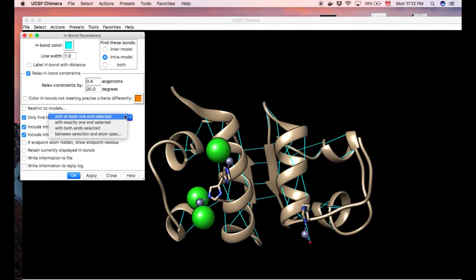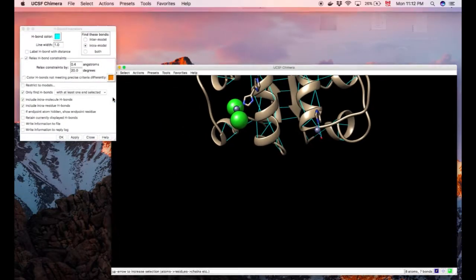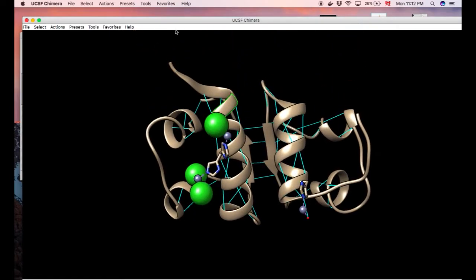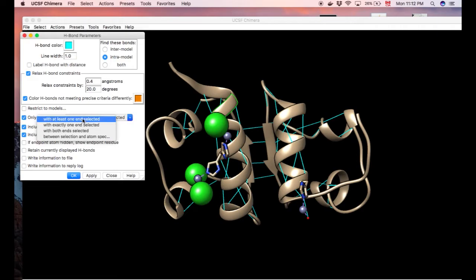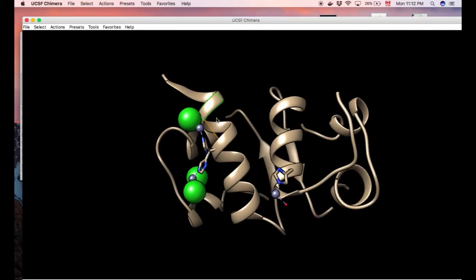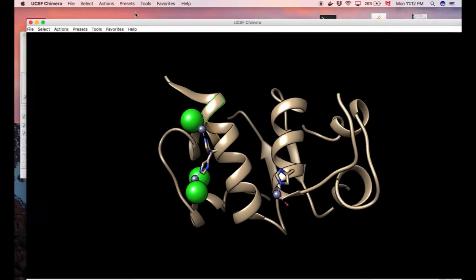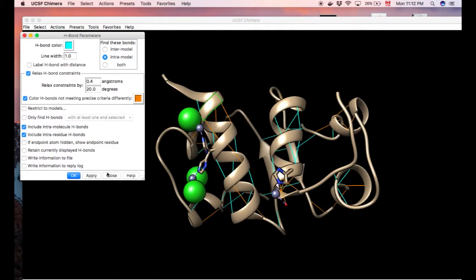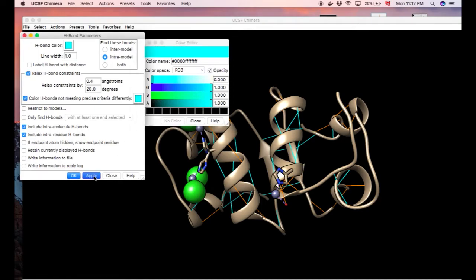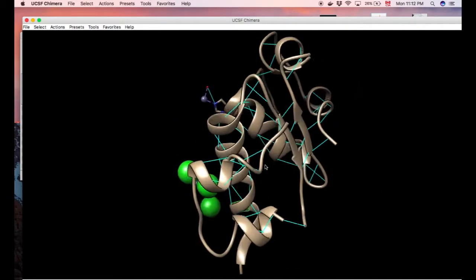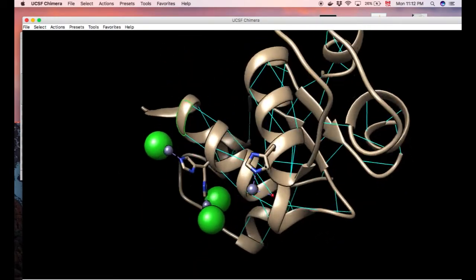Only find H bonds. Now you can have a little bit more selection. Let's say you select this position right here. And I'm interested in, wait, let's recenter this. Select this again. See in all H bonds with the end selected, I can apply. See that there's actually one H bond that's being selected right here. Instead of maybe if I do this and I apply, you can find everything over here. So now we change the criteria. So now it's red, but usually of course we can set this to blue. Let's make it a little bit nicer. Perfect. And apply. Perfect. For now, this should do the job. So this is actually the analysis of H bonds. Quite easy. UCSF Chimera makes it very quick.